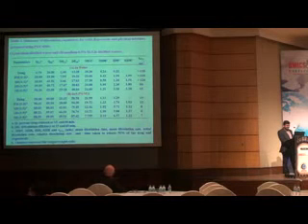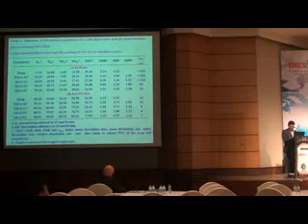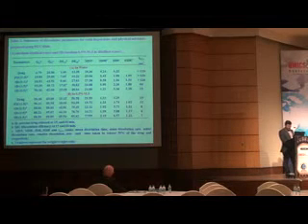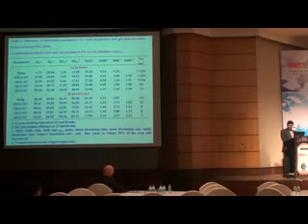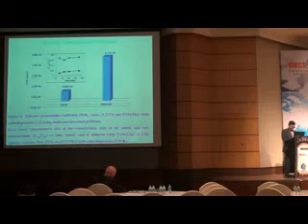The scanning electron microscope also suggests the formation of a smooth surface complex, as we see with that of PEG, when we compare with the pure drug. And the dissolution study of the solid dispersion suggested an improved dissolution rate of the solid dispersion in 1:9 ratio when we compare with the 1:9 ratio of physical mixture, and also solid dispersions 1:1 and 1:5. The same profile was observed in the medium, that is 0.5% SLS in distilled water. A similar increase in dissolution rate was seen in the 1:9 ratio.